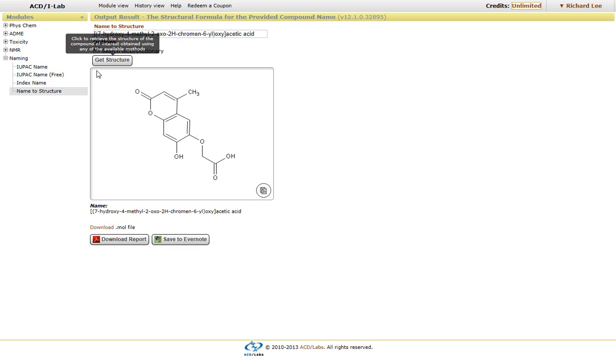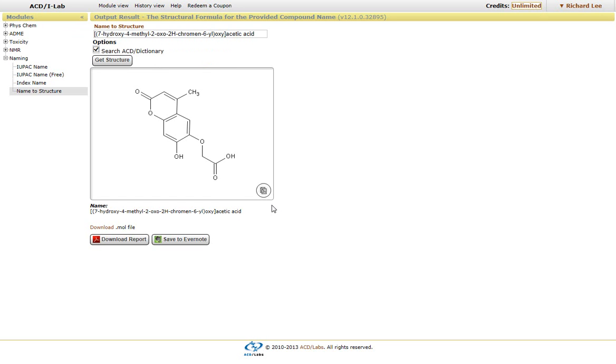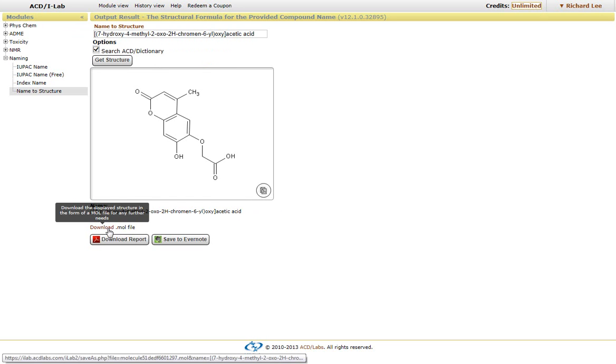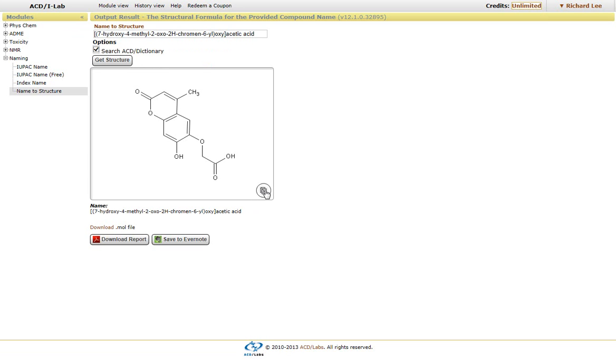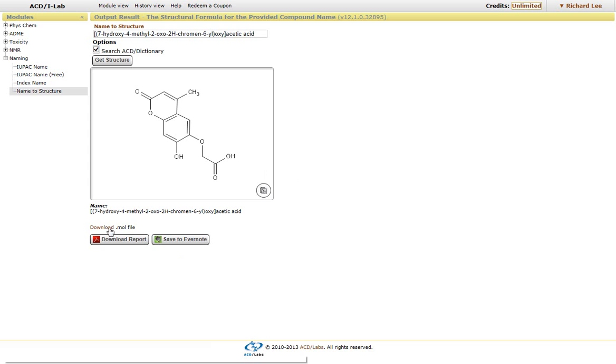You can download this structure, whether it's in a mole file, by clicking on download. Or you can copy and paste the structure into a Word document or another drawing module. You can also download a report - basically a PDF file with the structure and the name of this particular compound.